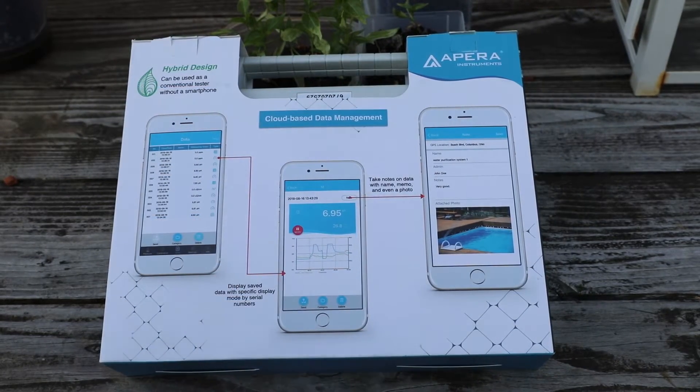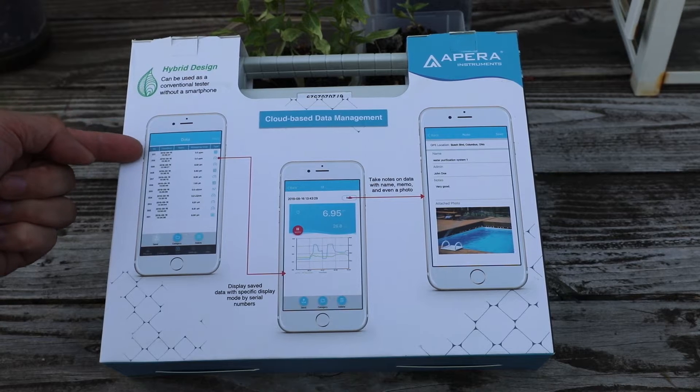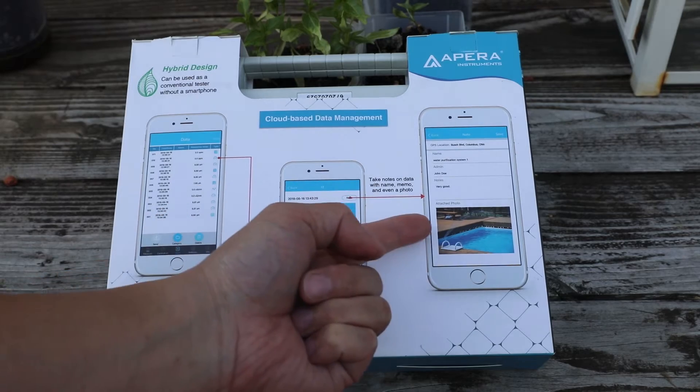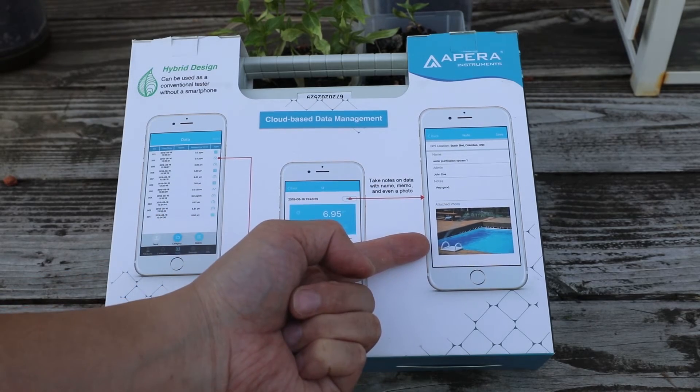On the back you see the marketing demonstration of the Zen software, including graphs and the ability to include notes into your readings.